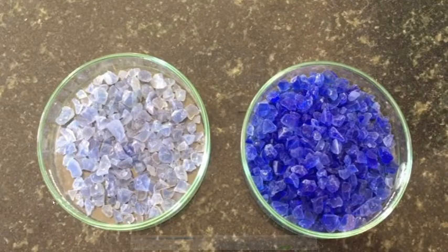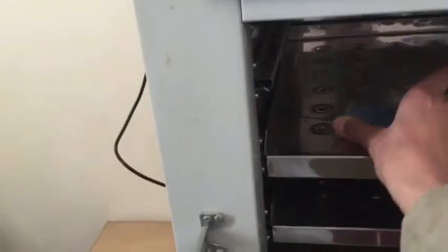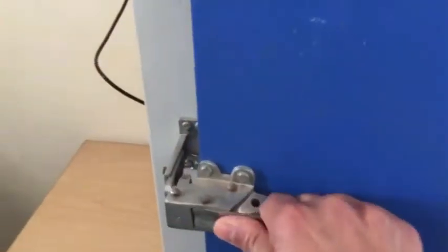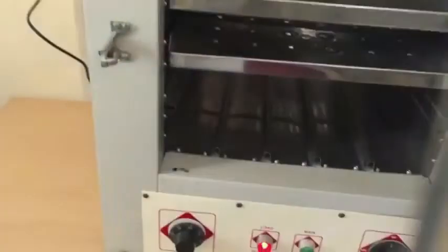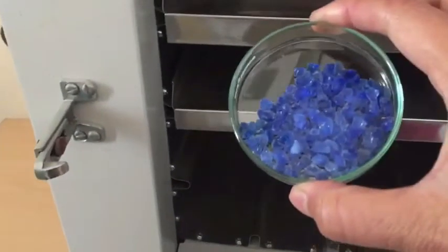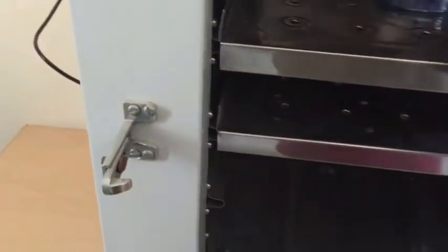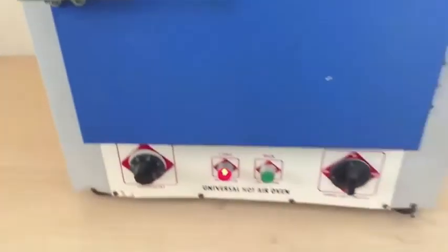To regenerate the silica gel, keep it at 140 to 150 degrees Celsius in the hot air oven. I am now putting this new silica gel in the hot air oven. The oven is at 140 degrees centigrade and after half an hour it looks like it is not completely regenerated, so I will keep on heating it for a further half hour.